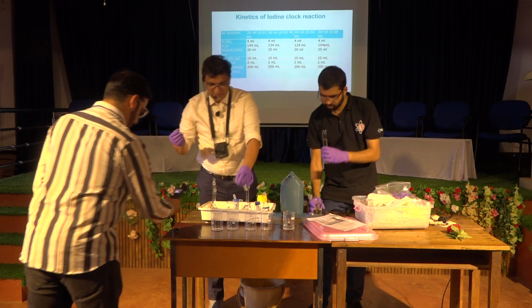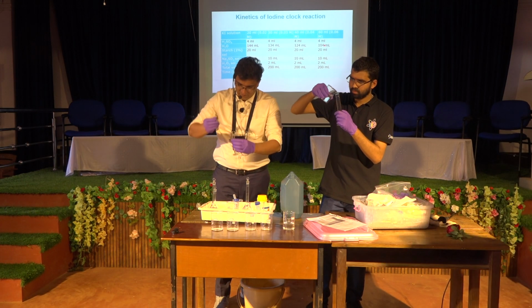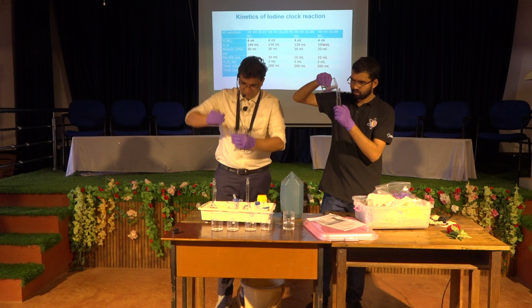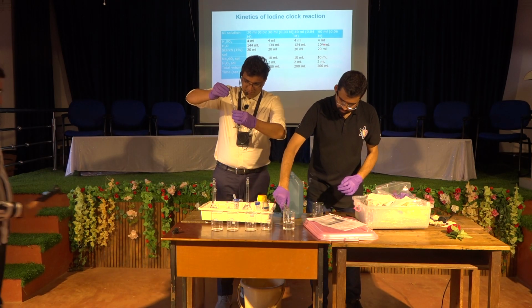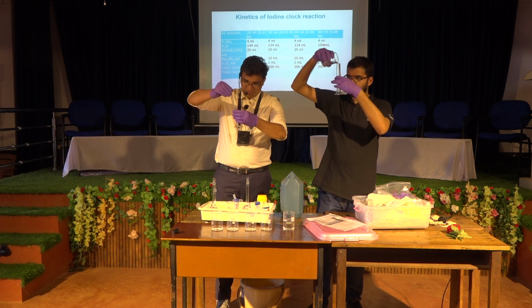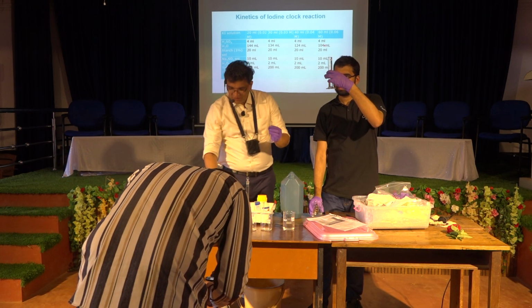And what I am doing is I am adding sulfuric acid. Okay. Have you seen sulfuric acid?